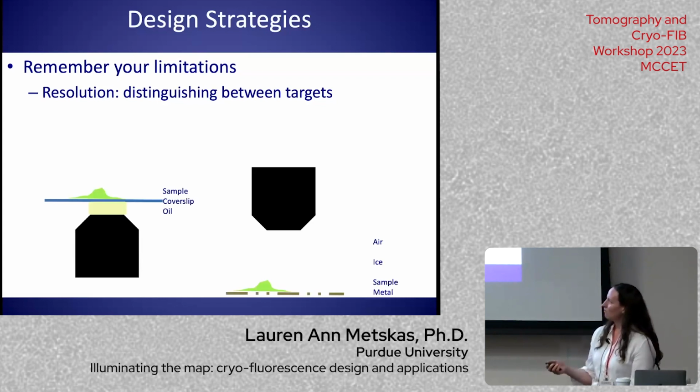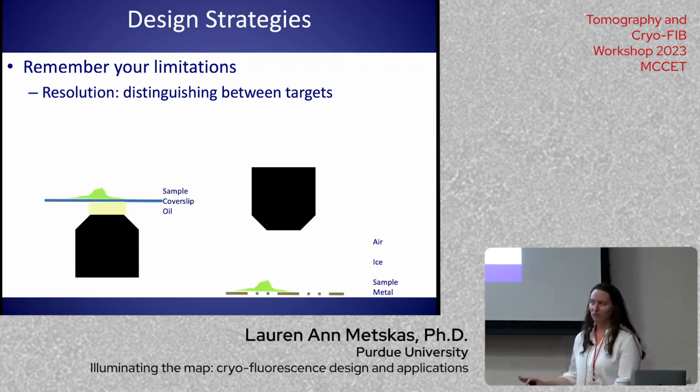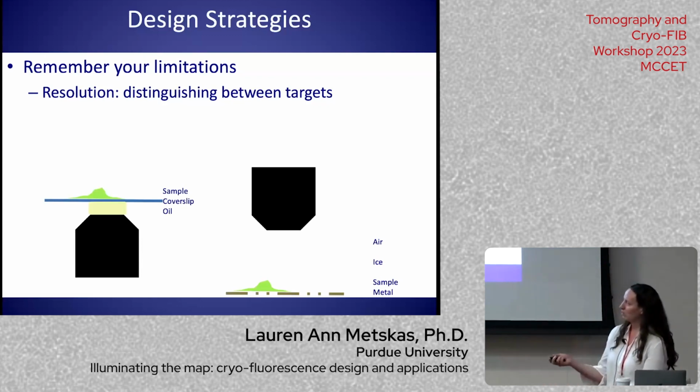And so the reason for this is due to the optics of how these systems are set up. And this is a really intractable problem. So this is where a lot of us are trying to work in development right now, getting this to higher resolution. So what's the problem?